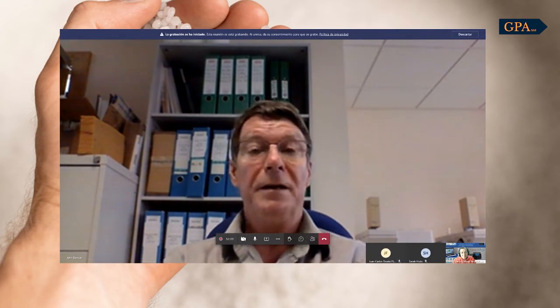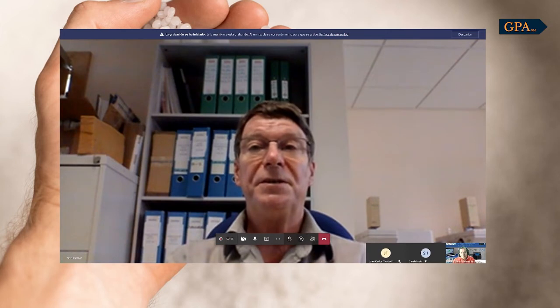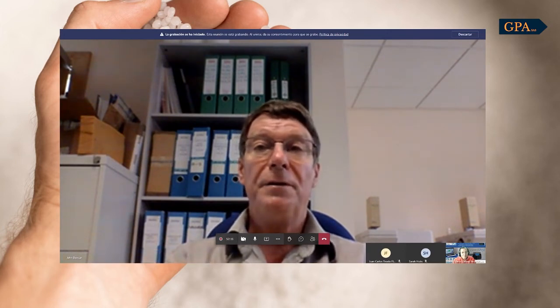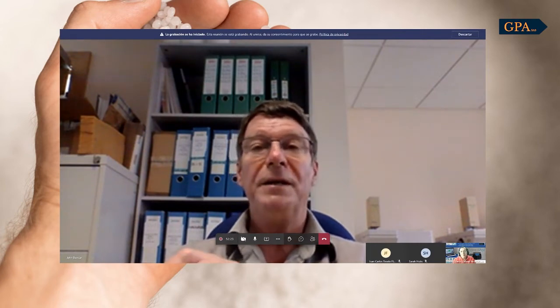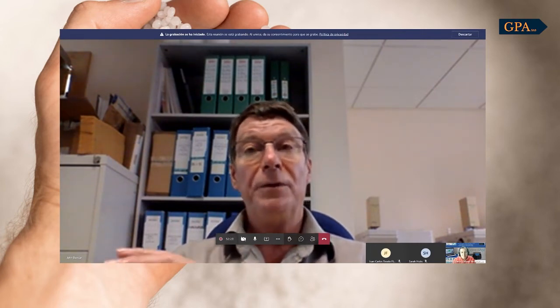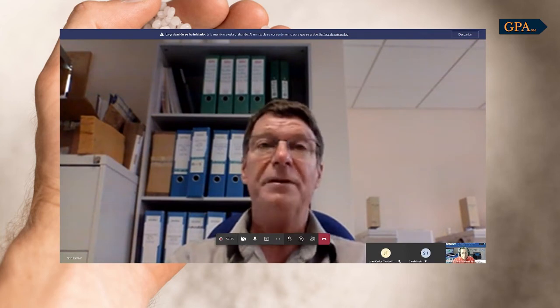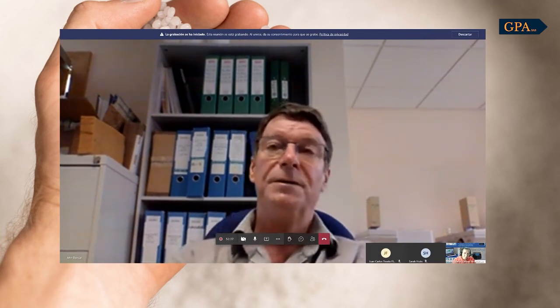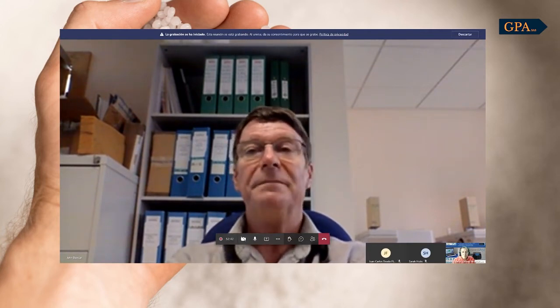And then if you add that material into the reference set, the reference sets are self-scaling. In other words, if the material that you use is quite variable, then all of the variable material will automatically fall within the acceptable range. If, on the other hand, the material is very precise, then even a very small difference will show a very big difference in our quality index score. So you don't have to worry about that. That scaling is completely automatic.